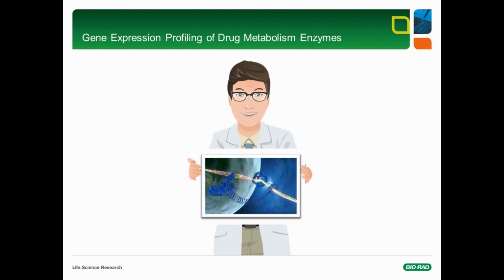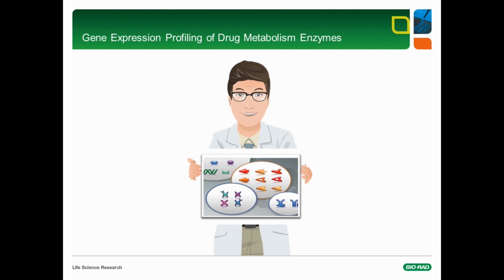of a candidate drug. Drug metabolism enzyme expression profiling for candidate drugs can be performed early in the development using in vitro cellular systems, and because the cost is much lower than that of animal studies or clinical trials, large compound libraries may be screened.